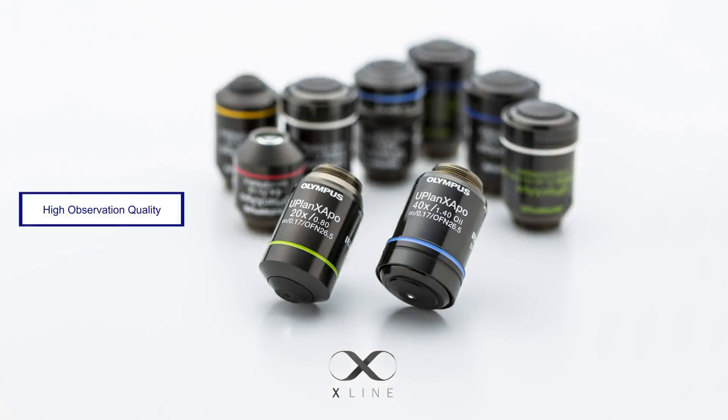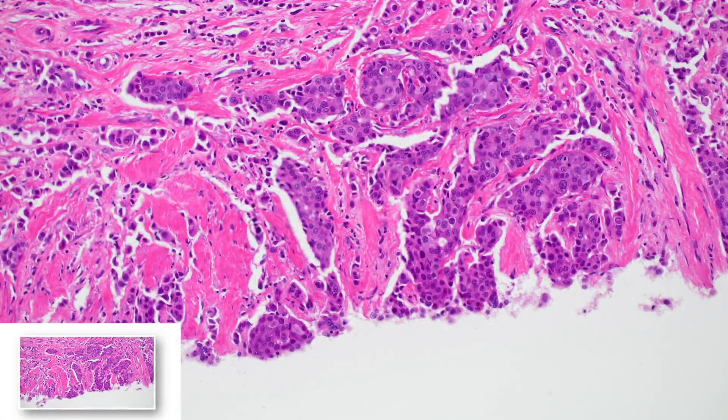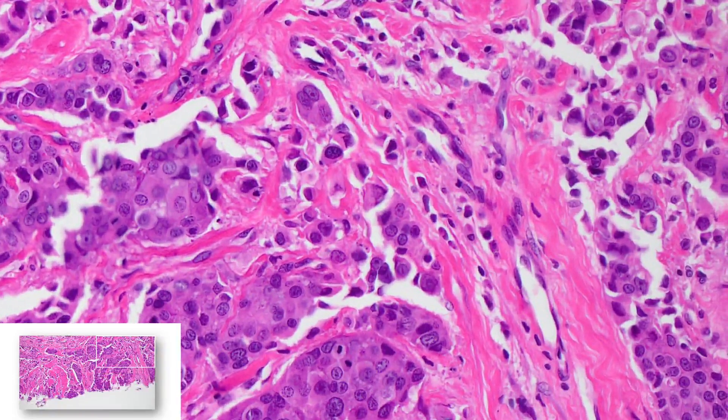And when used with X-line objectives, you get images that are sharp, flat, and focused from the center to the edge of your field of view.